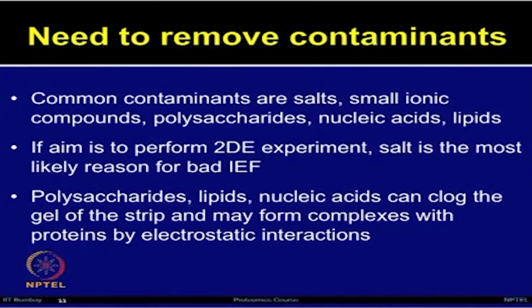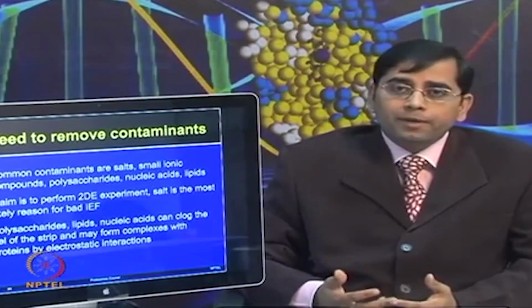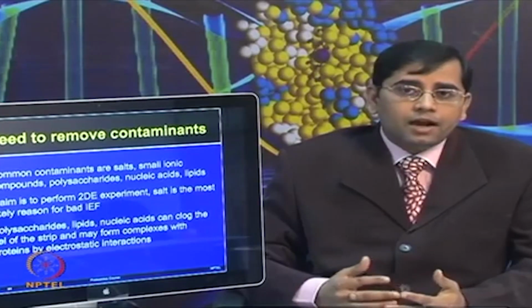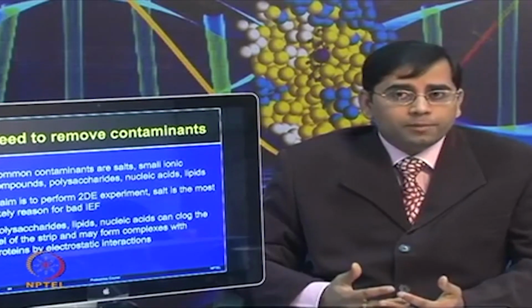These components can form complexes with the proteins by electrostatic interactions, and when you are separating the proteins using gels, they can clog the gel. So, in gel based proteomic methods, these artifacts are going to affect the quality of the experiments very much.